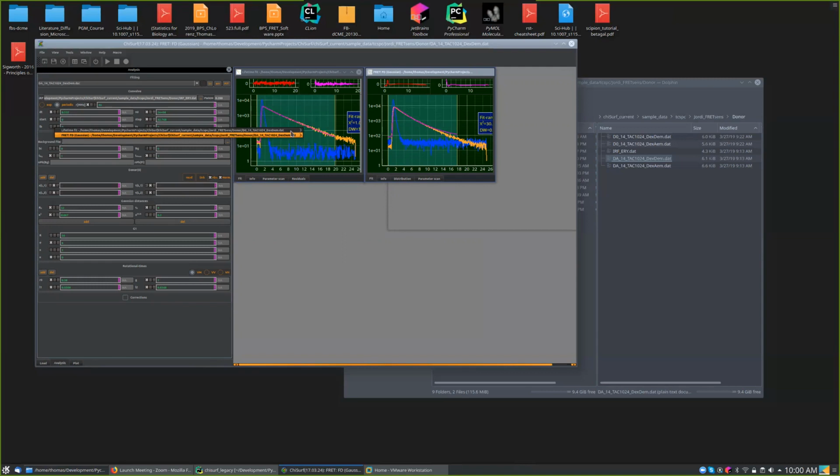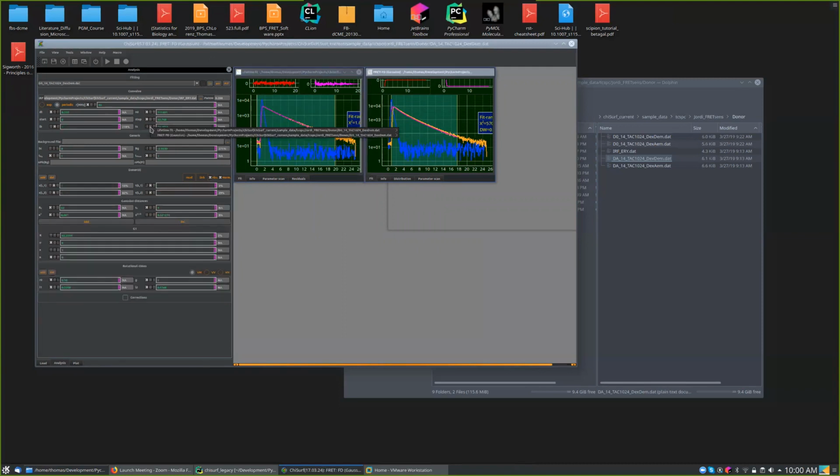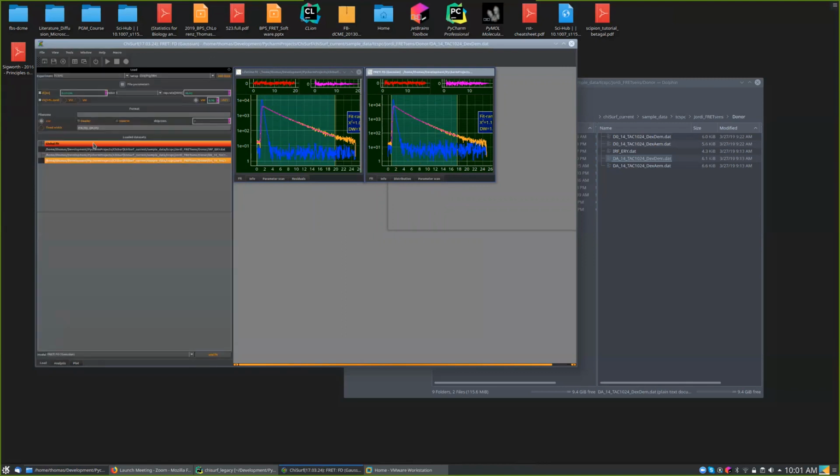And the background I also connect to have fewer parameters. Time shift, I guess the count rate is similar, so I can also connect this. This didn't work. Scatter. Okay, the background is negative. I think I clicked wrong here. I connected the time shift wrong. Okay, now it works.